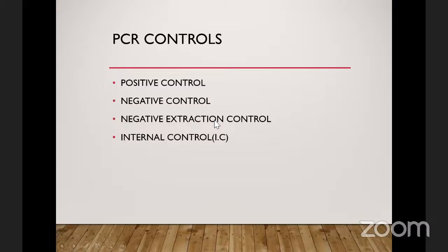Remember when we were talking about the quality of sample and extraction, I said DNA polymerase has so many things that can inhibit it, including the EDTA that is part of your reagents that you use for lysis, including the reagent that you use in even doing the extraction, the wash buffers. Most of those things have the ability to inhibit PCR.